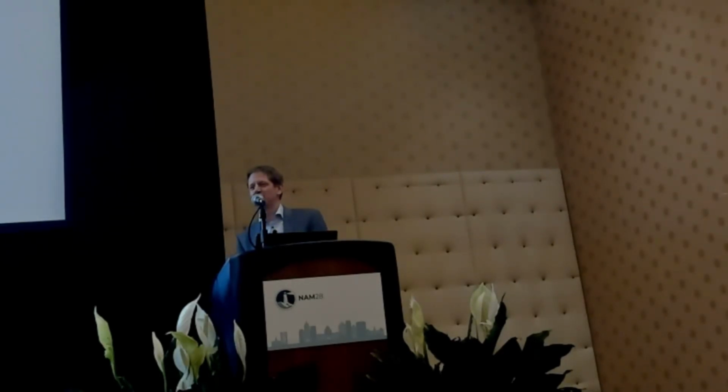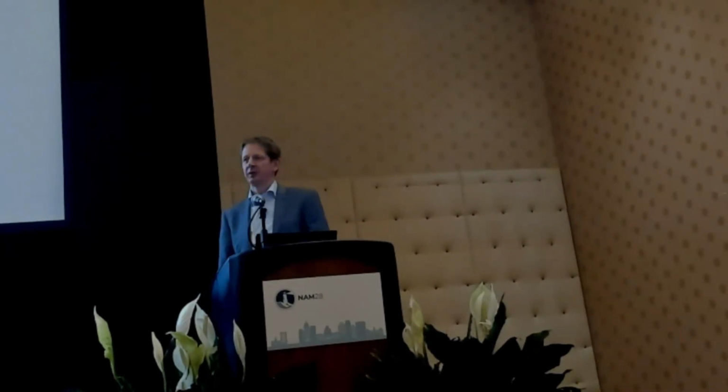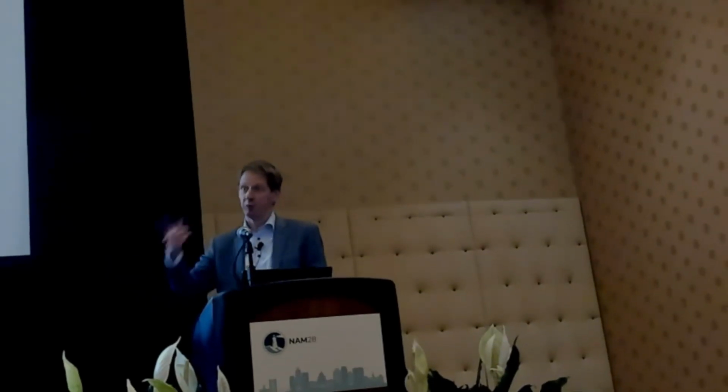The palladium shows up with the same activation. Is that a deactivation point? Or negative? Sorry, in the third example. No, it's not a deactivation. It's just that in the absence of oxygen, if you wait long enough, it goes to 3 plus. As soon as we start the reaction, right, the reduction step is quite slow, the oxidation step is very fast. So as soon as you switch back on oxygen, you go back.